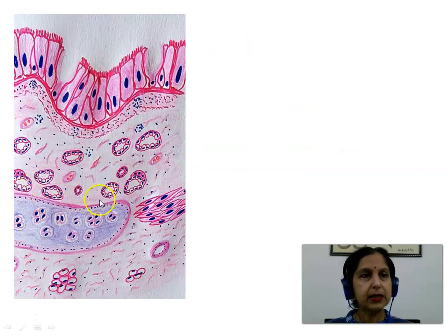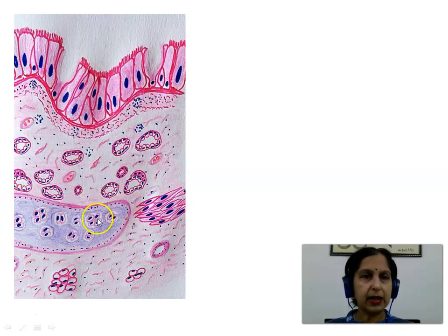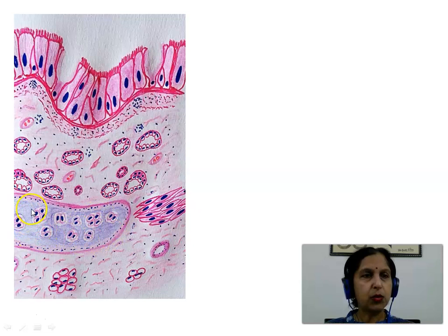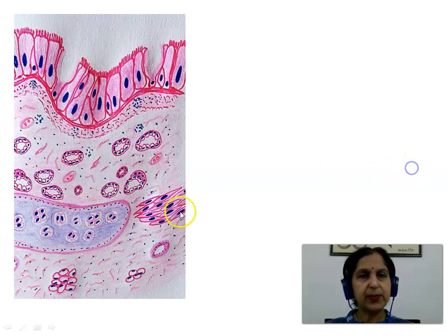Here we see the posterior end of the C-shaped cartilage ring. It is hyaline cartilage showing chondrocytes present as cell nests surrounded by lacunae, along with the homogeneous glassy matrix. The perichondrium shows outer fibrous and inner cellular layers. We also see the fibroelastic tissue and the trachealis muscle made up of smooth muscle fibers.